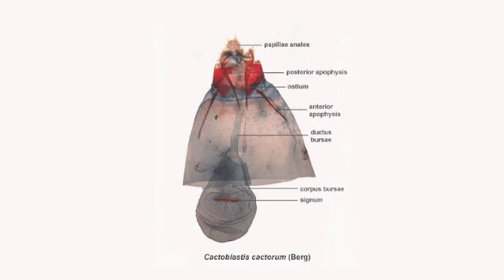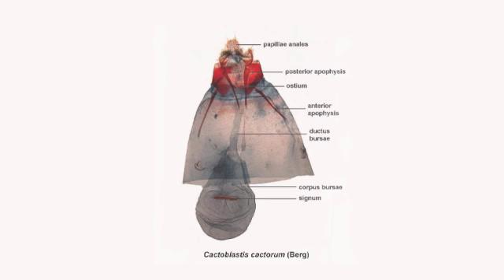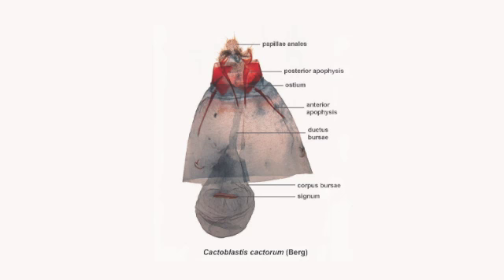Here we can see the structures of the female genitalia, including the papilla annales or ovipositor pads, the apophyses for muscle connections, the ostium or opening for insemination which leads into the ductus bursa and the corpus bursa where the spermatophore is stored after mating. Whether or not the female has mated can be determined by the presence of the remains of the spermatophores in the corpus bursa.